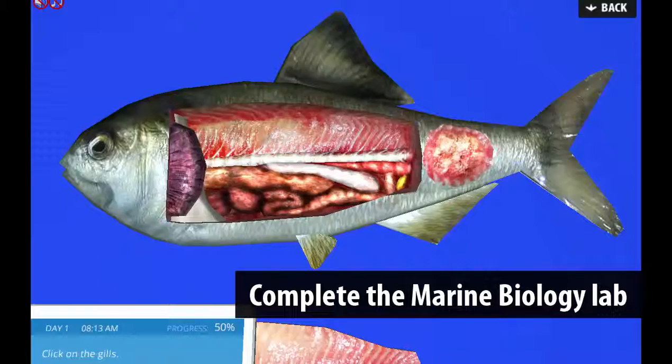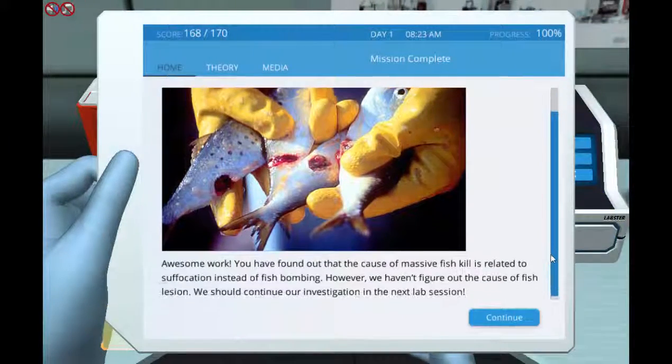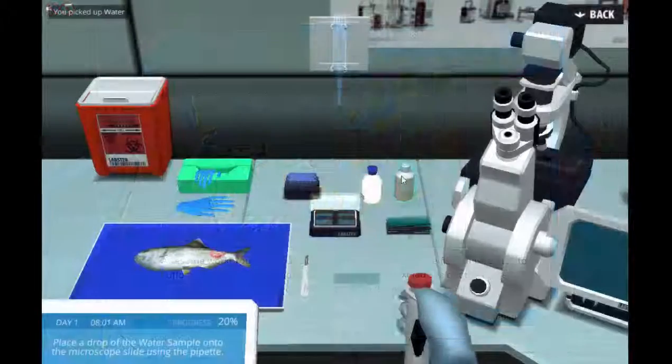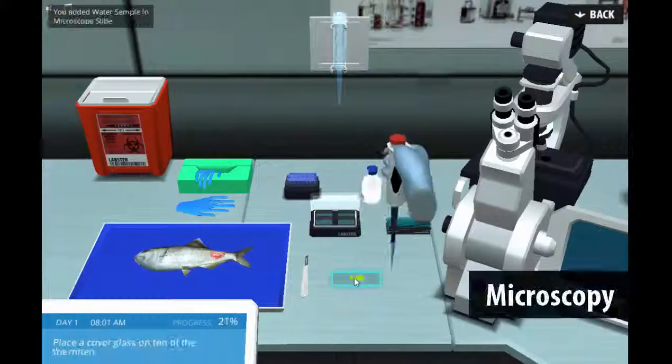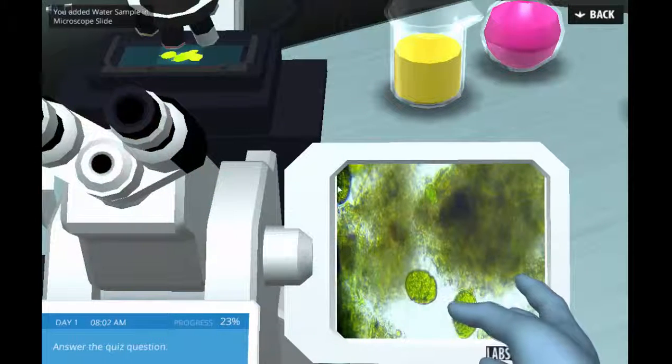In the Marine Biology Lab, students have found that the low oxygen in the water was causing the suffocation of the fish. Looking for more data, they'll analyze the water sample using the microscope. In this way, students can study the biological matter in the water.